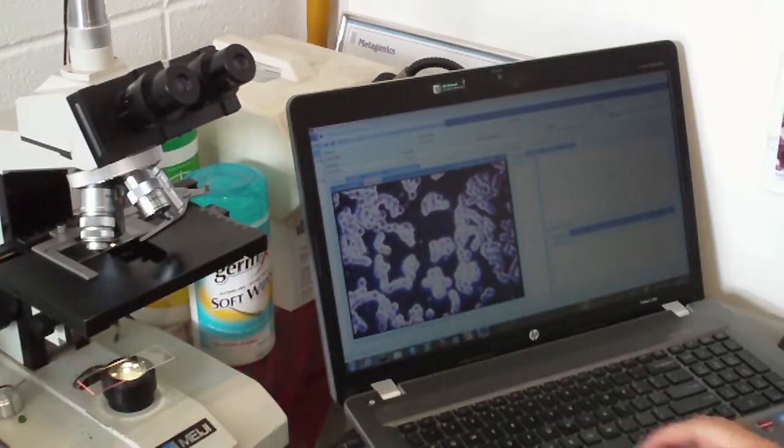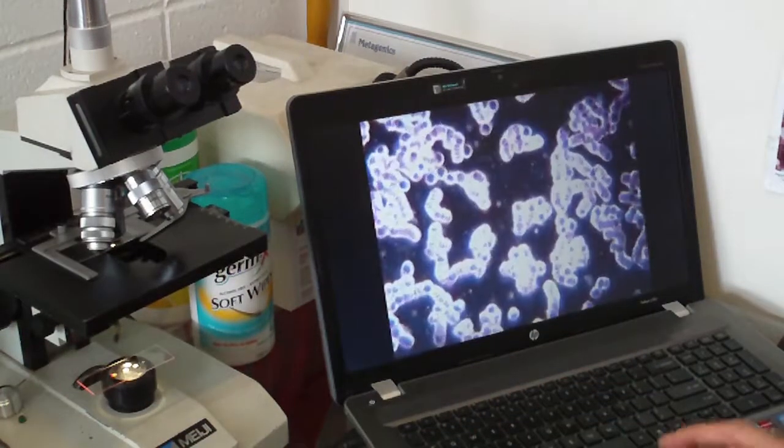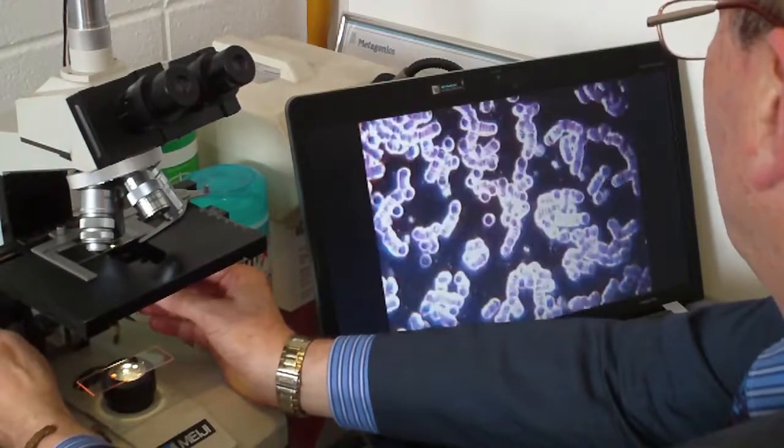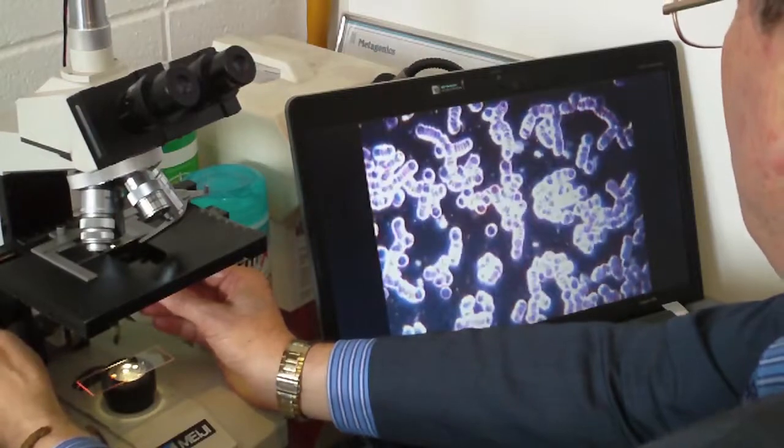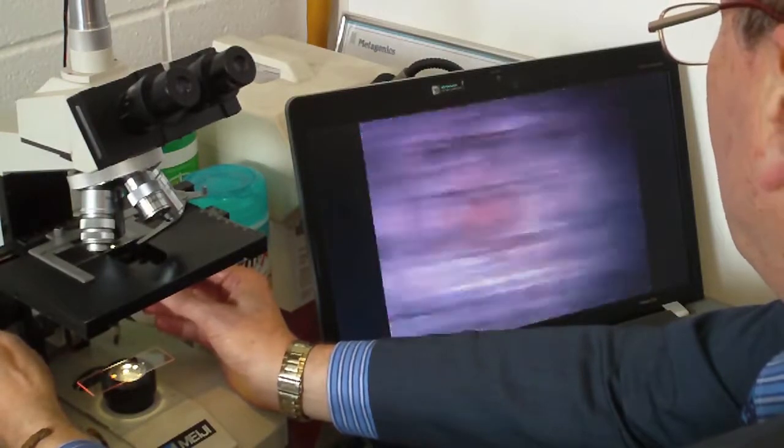Great. So if we have a look here, we can see on full screen, this is the patient's blood. Now, there is a little bit of clumping going on here called Rouleau. Rouleau is where the cells aren't completely separated.